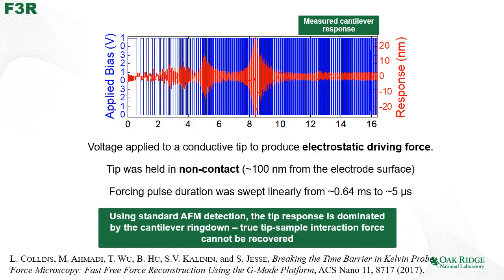Can we explore it systematically? Yes, we can. So this is the example of the measurement when we sweep the frequency of the excitation driving force. So we start with the square wave, but we make it faster, faster, faster. We measure the response of the cantilever, and you can see rather beautifully that for very slow frequencies, the response jumps, and then there is a ring down. And then when you accelerate it, the distance between the jumps becomes so small that you start to see almost the sinusoidal response of the cantilever itself.